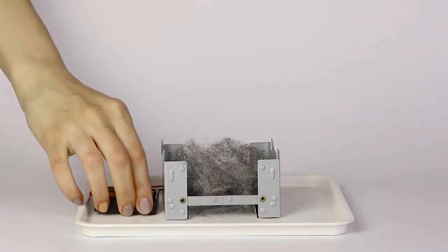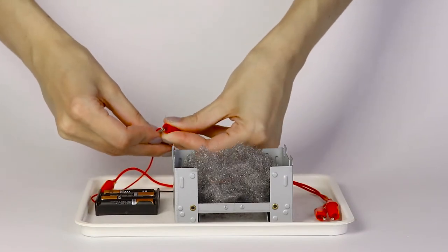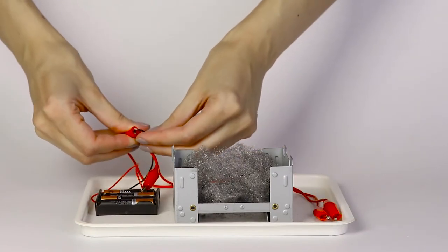Now take the battery holder with the batteries and the crocodile clip wires. Attach the crocodile clips to the wires in the battery holder.